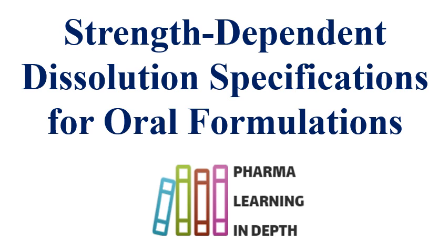But we are generally not known to this topic of strength dependent dissolution testing, dissolution parameters, dissolution conditions, and the specifications. This video will help you to understand in depth regarding all the points for strength dependent dissolution specification.